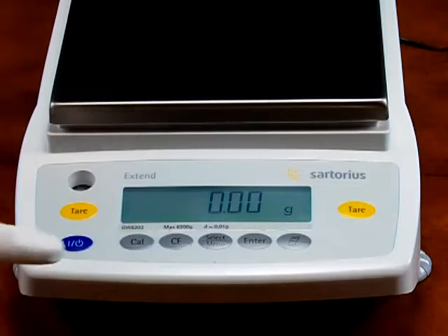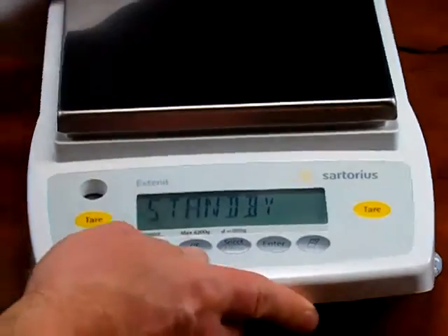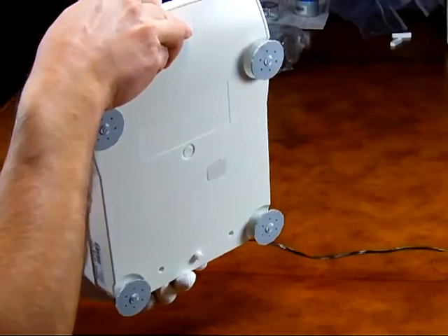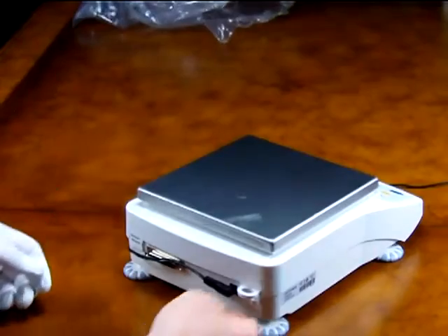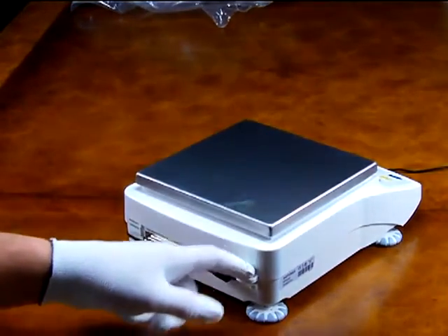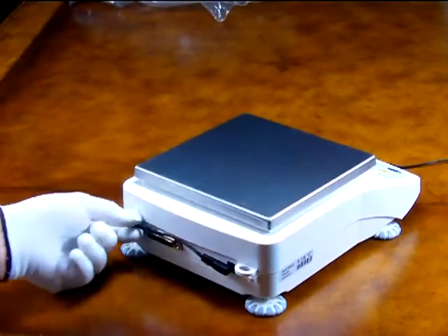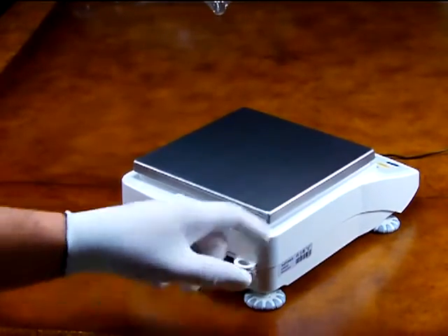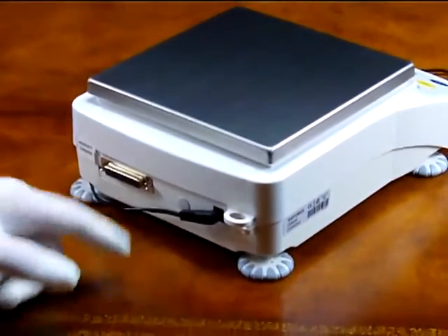The balance features a spirit level in the front so that you can level the balance. We also have four adjustable feet — many balances on the market only have two adjustable feet in the rear. Another great feature is a mounting bracket so you can put a cable lock through it. If this was at a college or any kind of business where you wanted to lock down the balance, you can put a master lock cable through here.